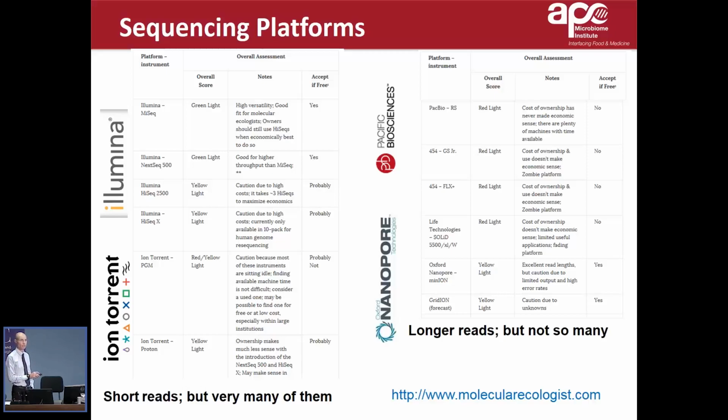and it really is a case of horses for courses. So which DNA sequencer you want to employ depends ultimately on what you want to do with it. So Illumina are the market leaders. They produce 80 to 90% of all sequencing that's carried out with their own instruments. You might be familiar with the MiSeq, the NextSeq, and the HiSeq.